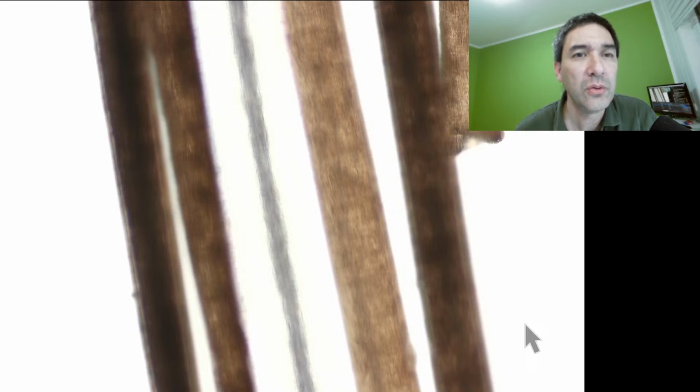I hope I didn't. But you can use them as a paintbrush. Actually, when shaving, you have those brushes as well. Yeah, it's camel hair normally. It would also be interesting to see how similar or different that is.